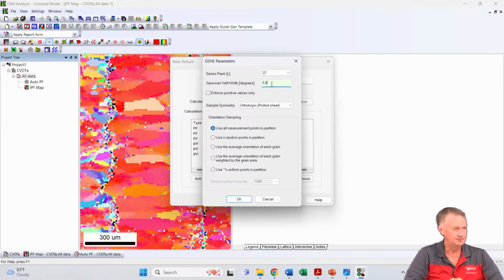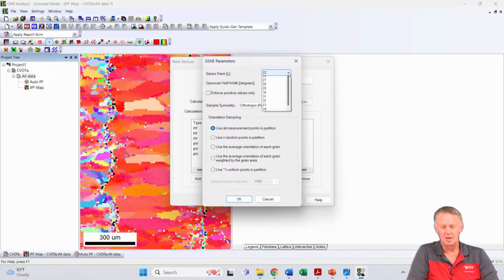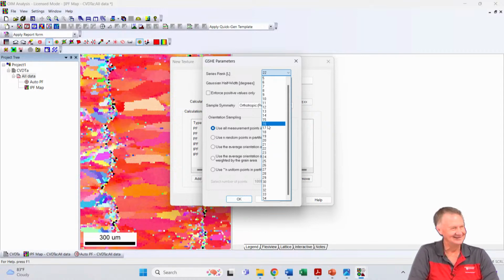Yes? Now you're selecting 22 or deselecting the 16? Previously you showed 16 and 22. It was at 16, and I just selected 22? Oh, no, okay. My question is, how do we decide this truncation, whether to select 16 or 22? It's just whatever was done before is going to come up, and then you have to decide what it's going to be, and it's the amount of smoothing.